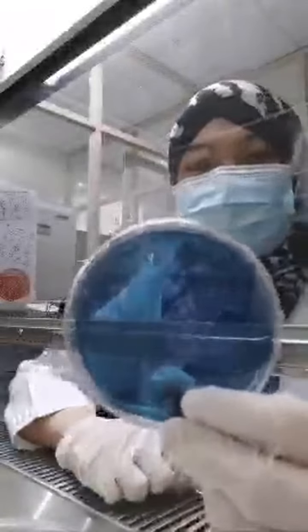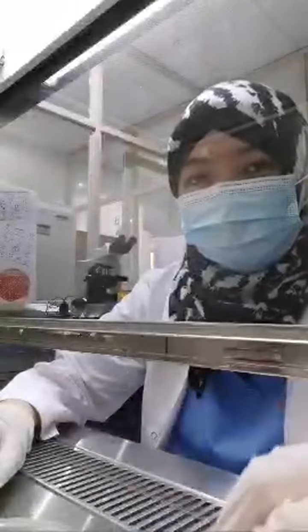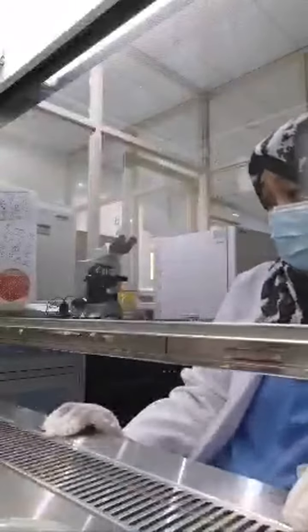This is the TCBS Agar. Ginagamit siya for the stool.